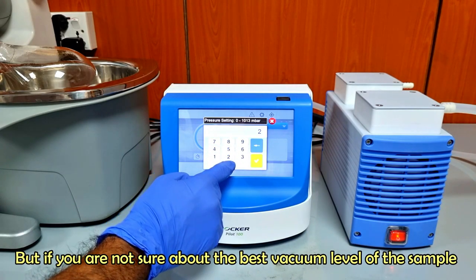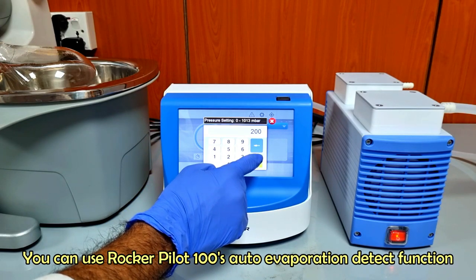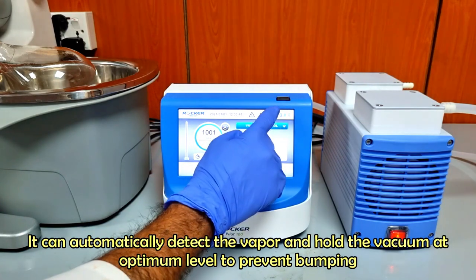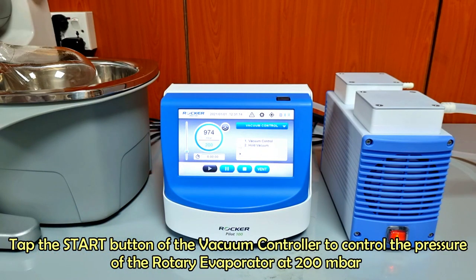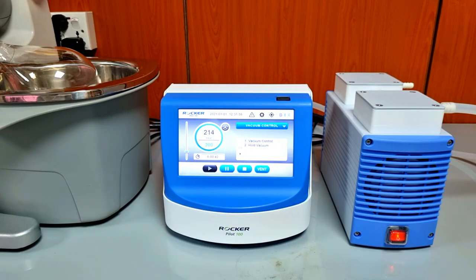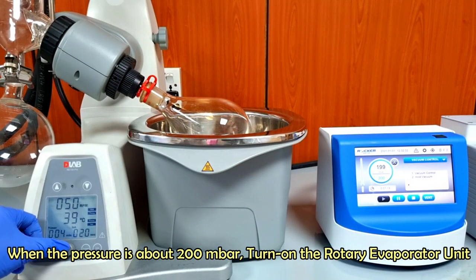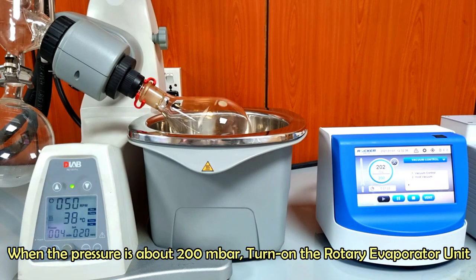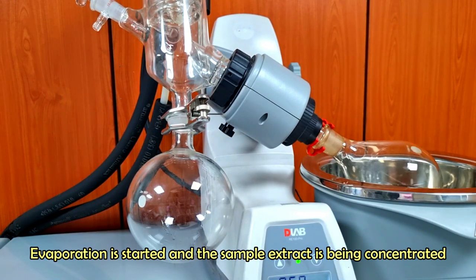But if you are not sure about the best vacuum level of the sample, you can use Rocker Pilot 100's auto evaporation detect function. It can automatically detect the vapor and hold the vacuum at the optimum level to prevent bumping. Tap the start button of the controller to control the pressure of the rotary evaporator at 200 millibar. The vacuum controller is adjusting the pressure of the rotary evaporator. Turn on the rotary evaporator unit. Evaporation has started and the sample extract is being concentrated.